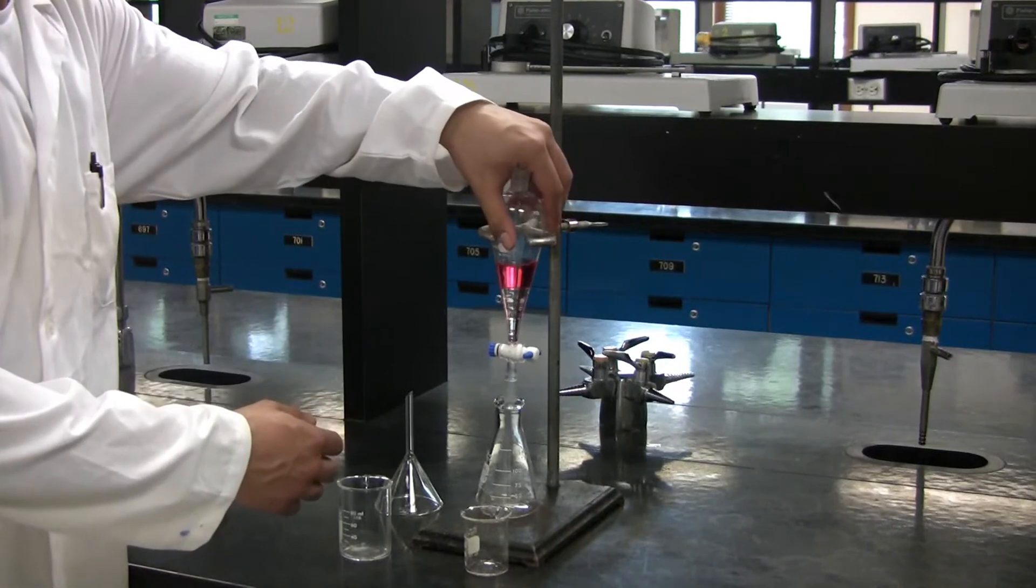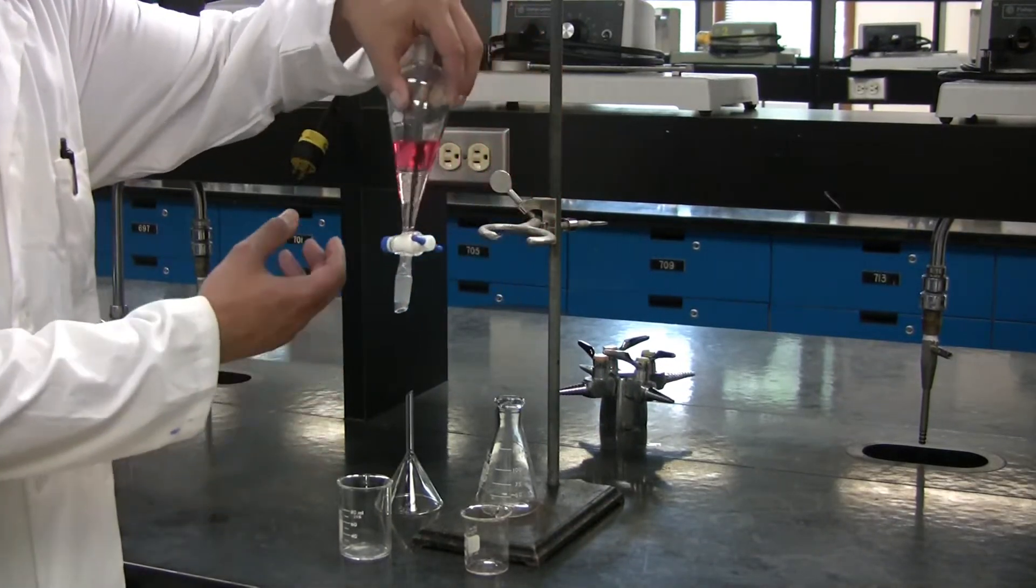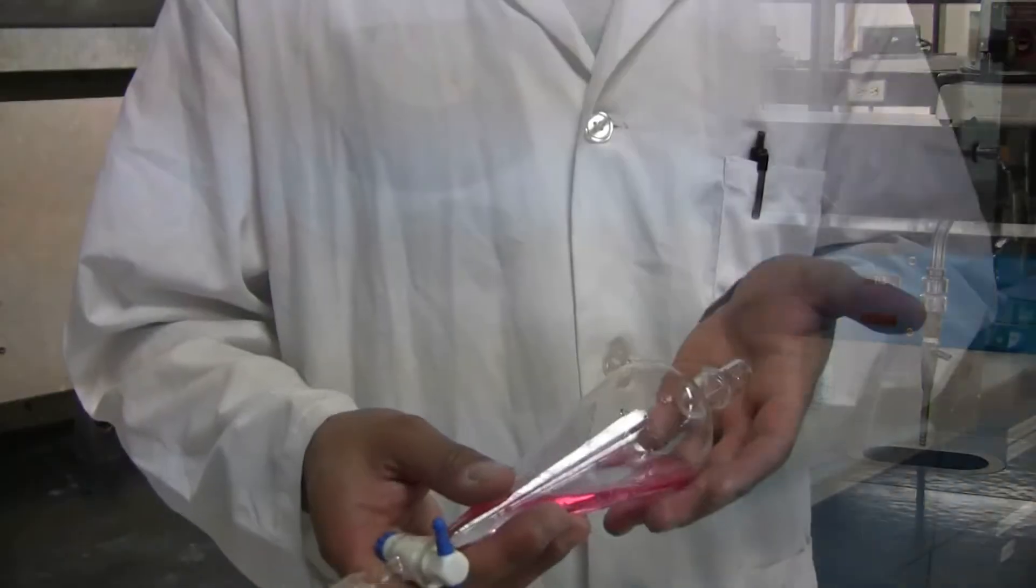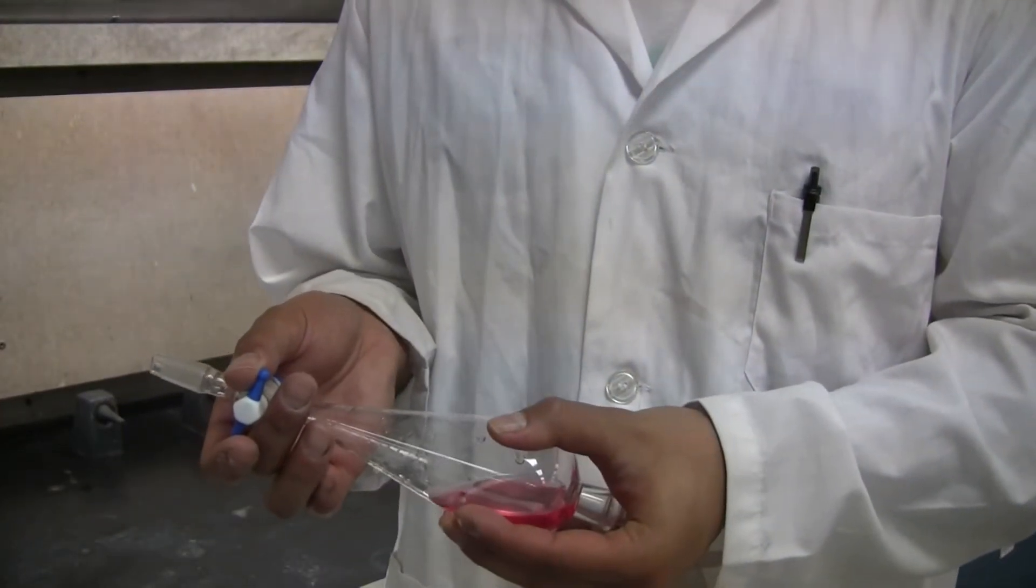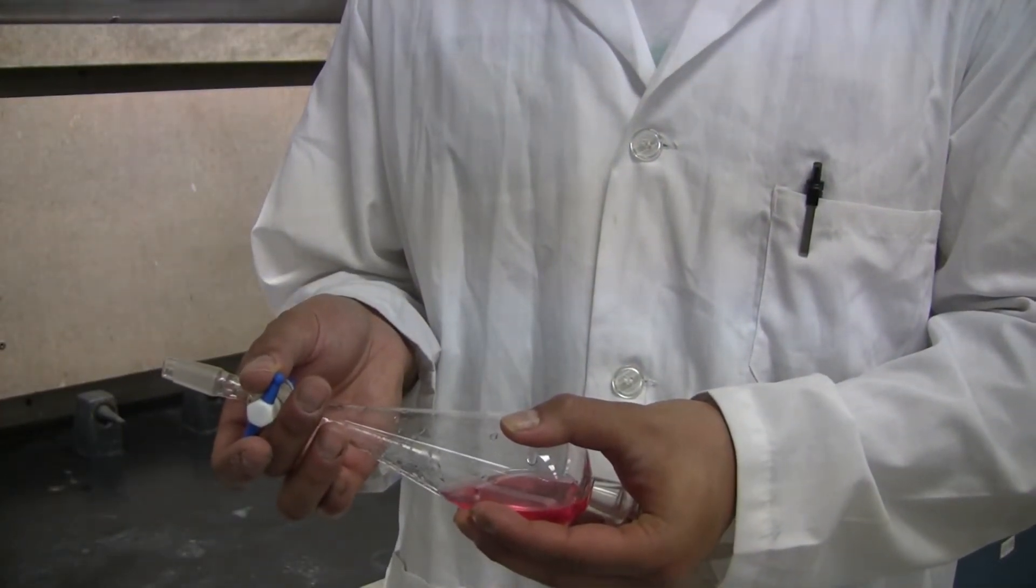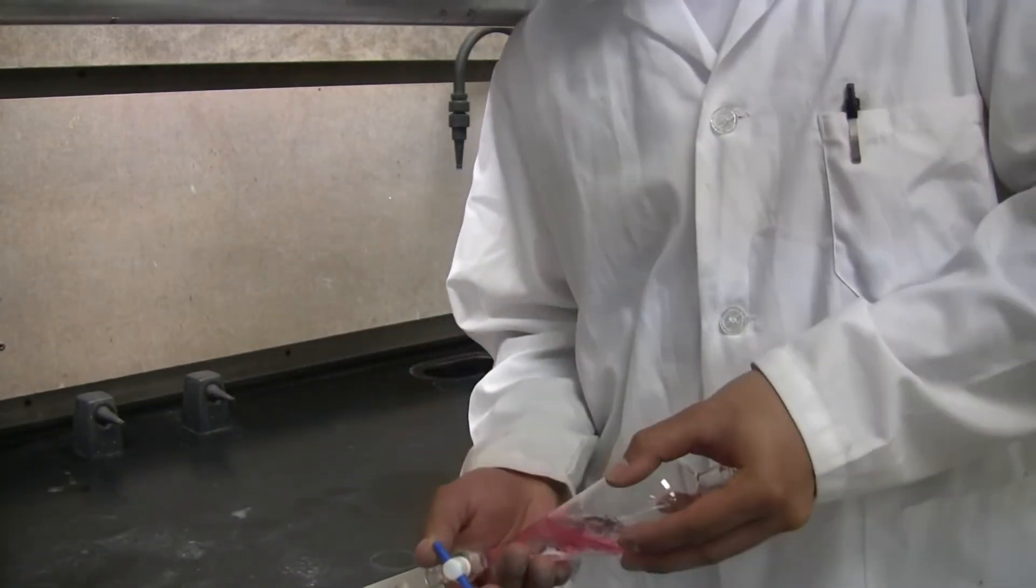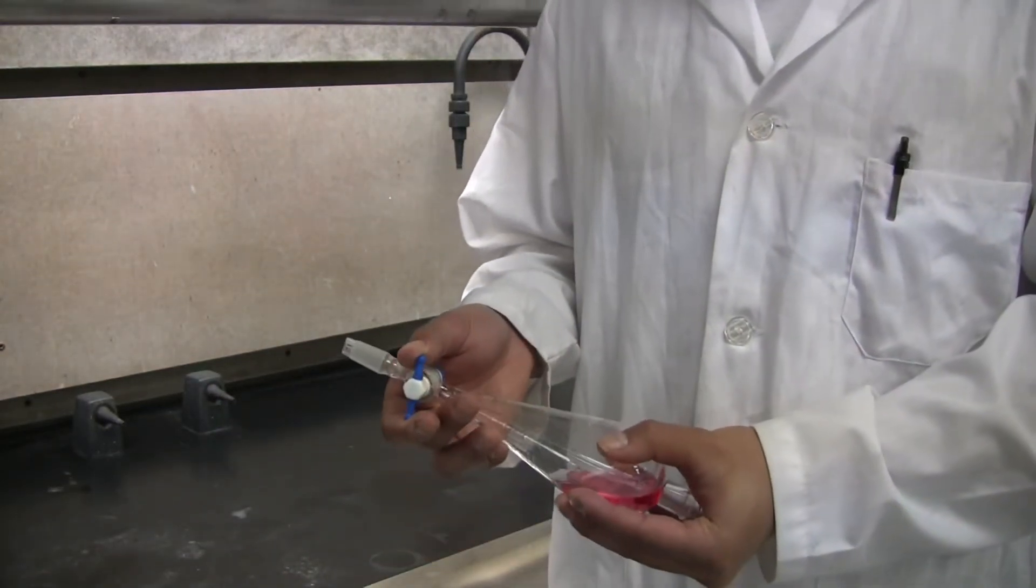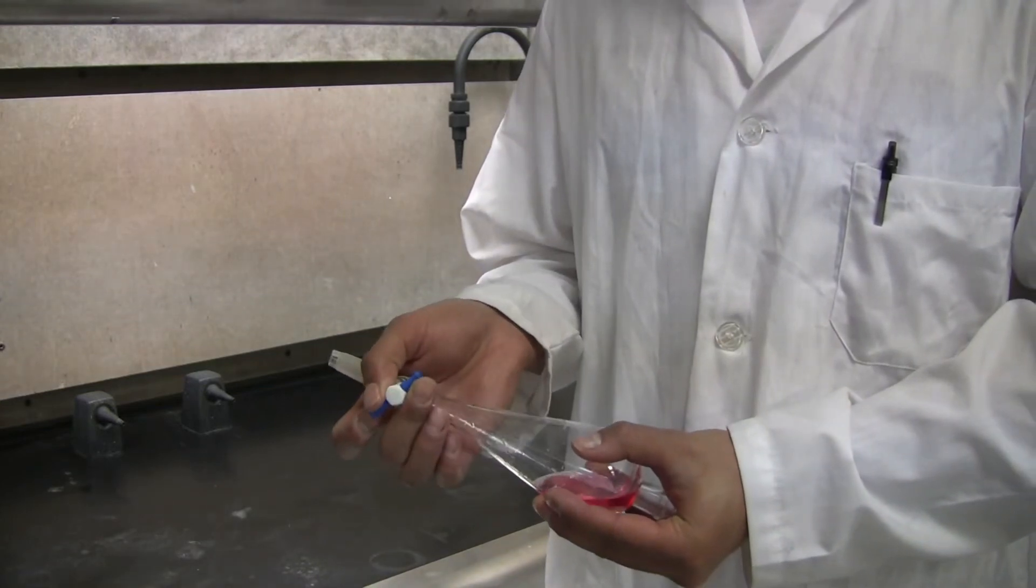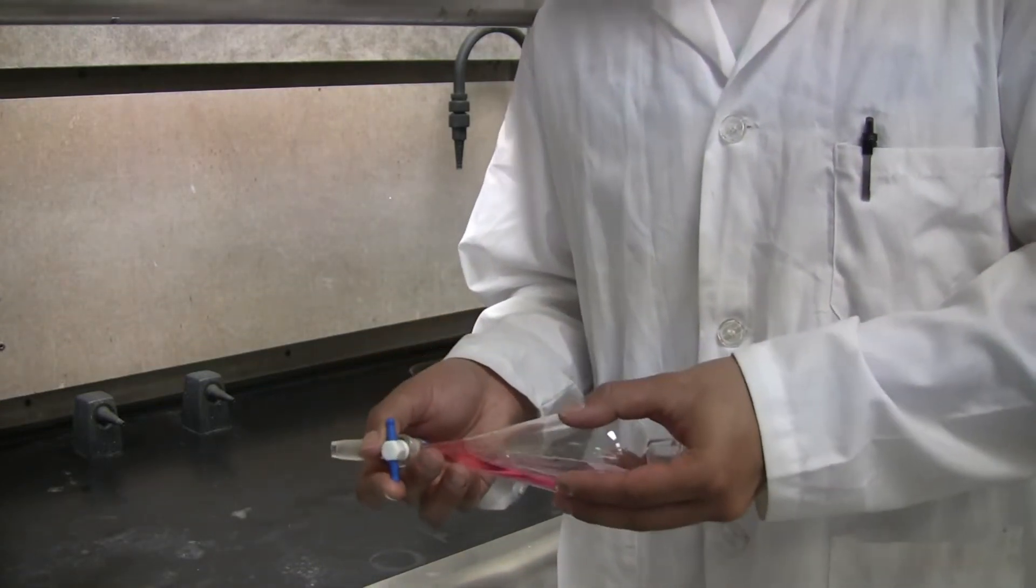Remove the separatory funnel from the ring clamp. Place the end of the glass cap into the palm of your hand. Now you can rock it back and forth, ensuring to mix the two layers sufficiently. Vent after every one or two rockings, and repeat this several times.